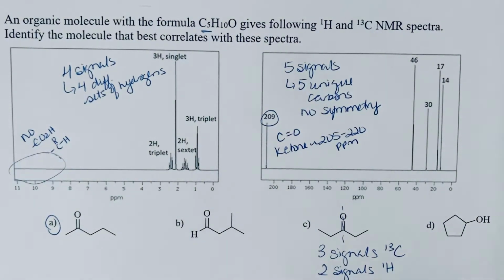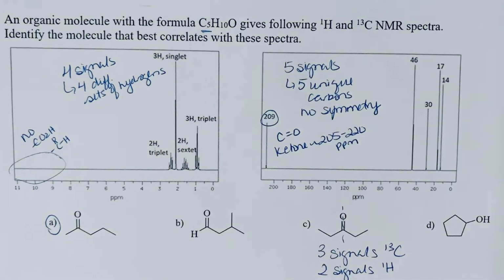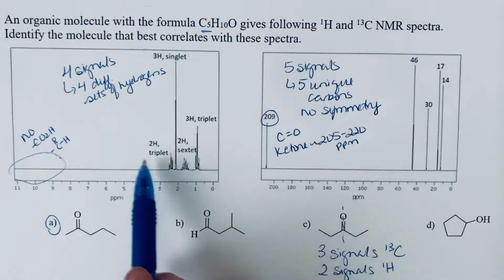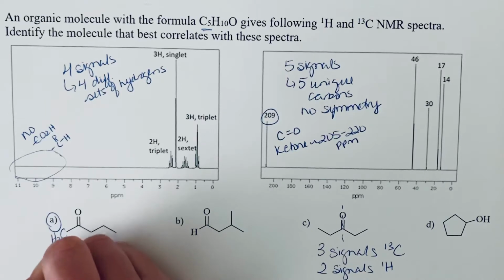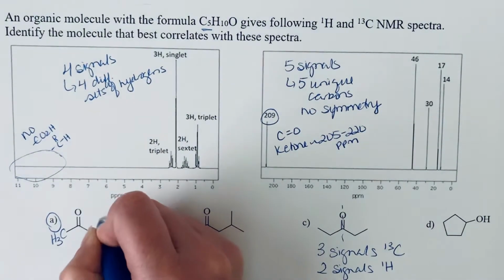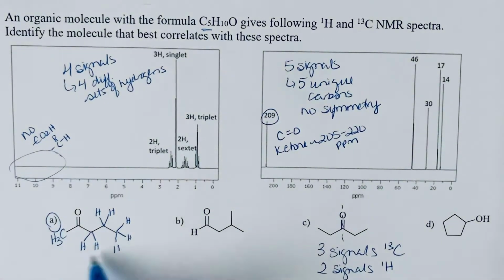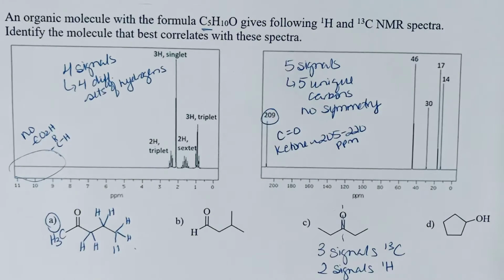And since we have that, let's go ahead and at least try to assign the proton signals. We actually looked at this carbon spectrum in an earlier video. So let's focus on the proton and make sure that it makes sense. So let me add in where all of our hydrogens are. So the hydrogens on each carbon atom are the same. And so we have 4 carbon atoms that have hydrogens. So that's giving rise to our 4 signals. So this is consistent.